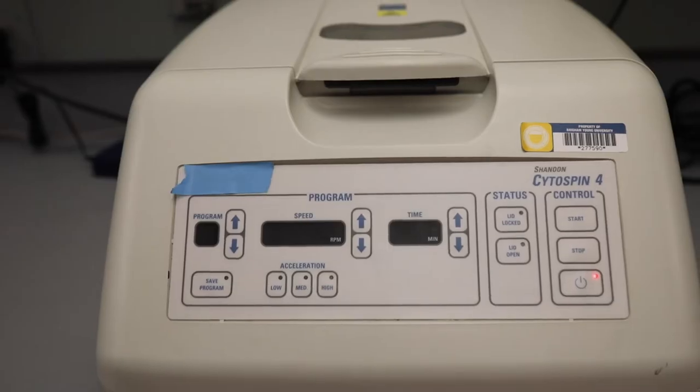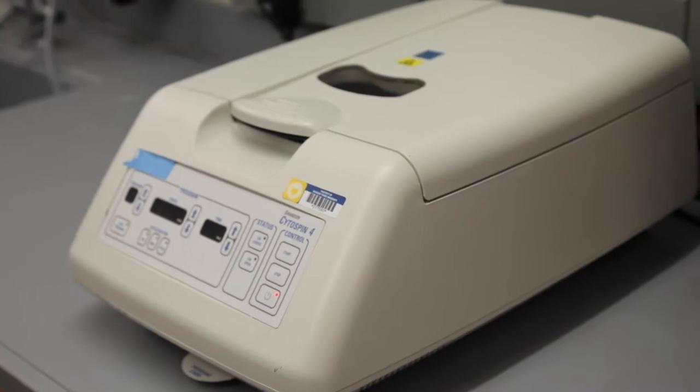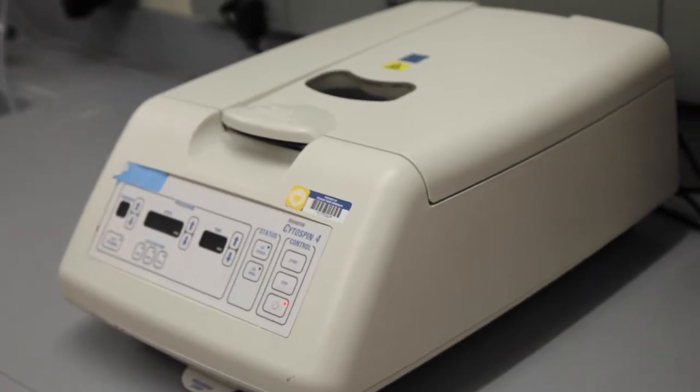The Cytospin flattens cells to be more easily visible under a microscope. The Cytospin centrifuges cells onto microscope slides.